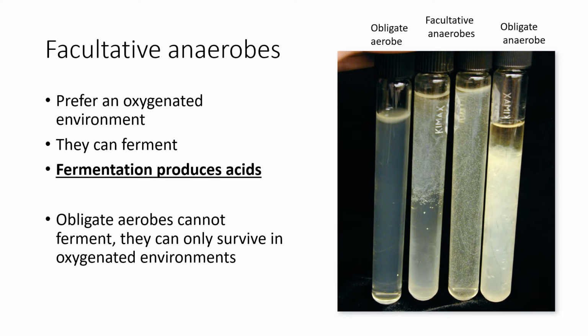And then over all the way to the right, the obligate anaerobe, you see it's just almost crystal clear right through the topmost part of this broth tube, and it's because they can't deal with oxygen at all, on any amount. It's growing really well below. In fact, I could actually see big clumps down here. Remember, if you can see it, that represents a ton. But all of this is frothy, and I can see stuff in there. And so wherever there isn't oxygen, they're quite happy.